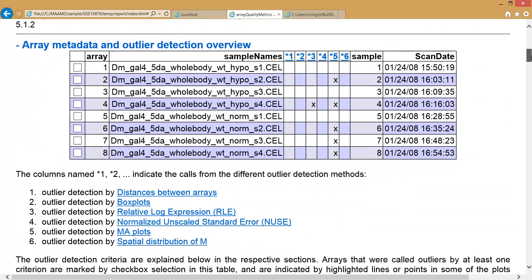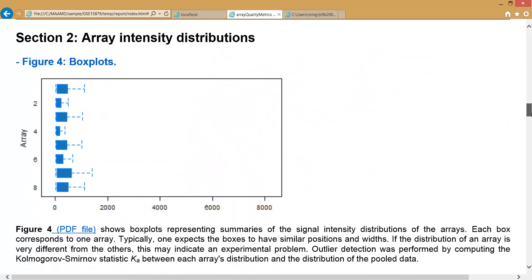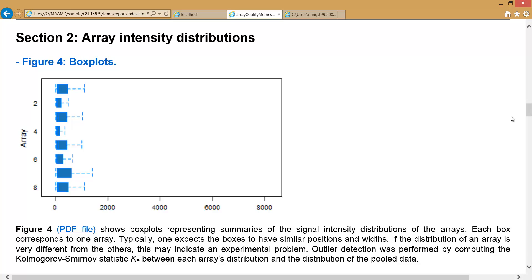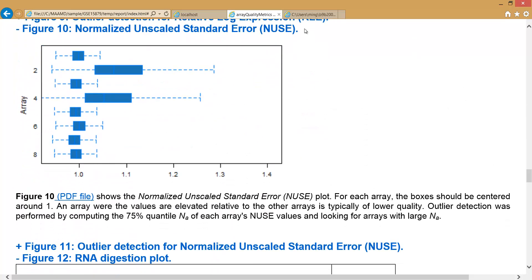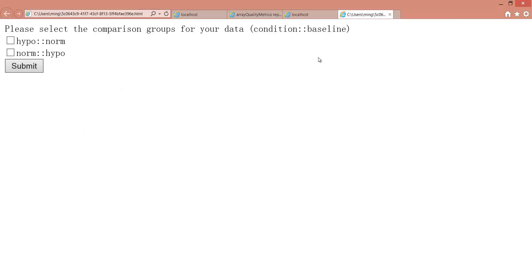Based on this report, you pick up qualified samples for further analysis. In this case, I select All. And you select a comparison condition for differential gene expression analysis.